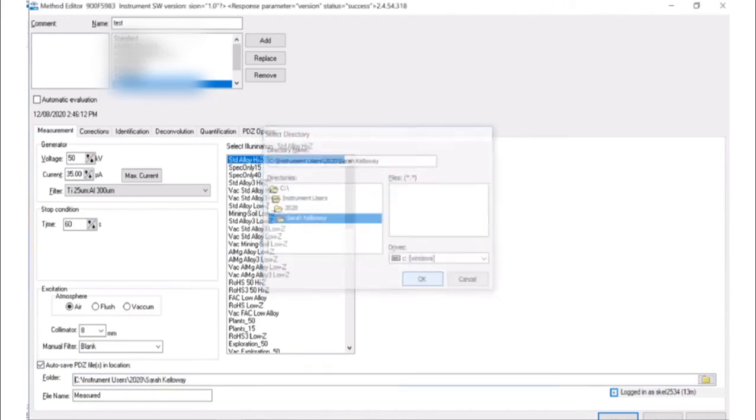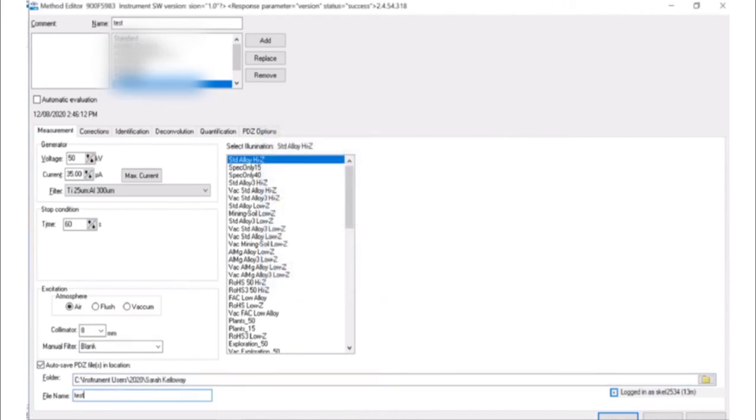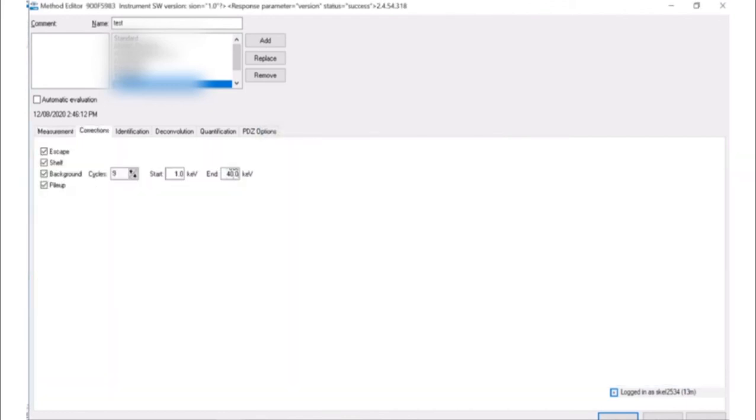In the correction tab, ensure that the escape, shelf, background and pile up boxes are checked.